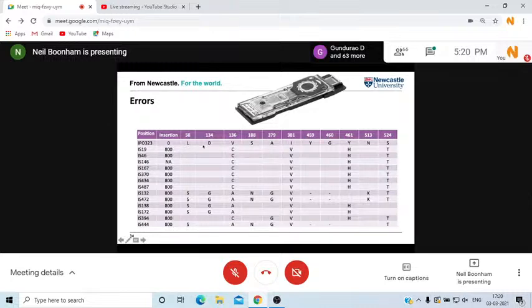And what this shows us, this is data from the flongle. And we compared this data to the same isolate sequenced using Sanger sequencing. So these were isolates that we'd collected, isolated the pathogen, isolated individual colonies, so they were clonal, and sequenced them using Sanger sequencing and MinION sequencing. And we were able to get the same results. So we were able to see these amino acid sequences, these single base pair changes in the amino acid sequences.